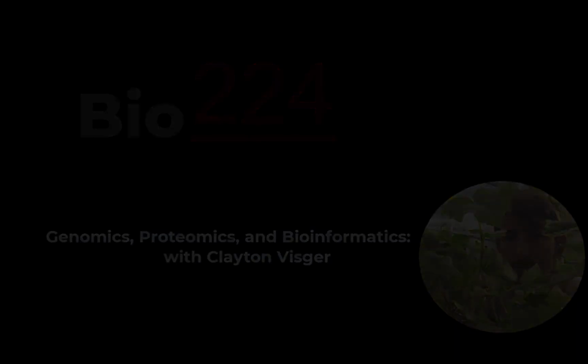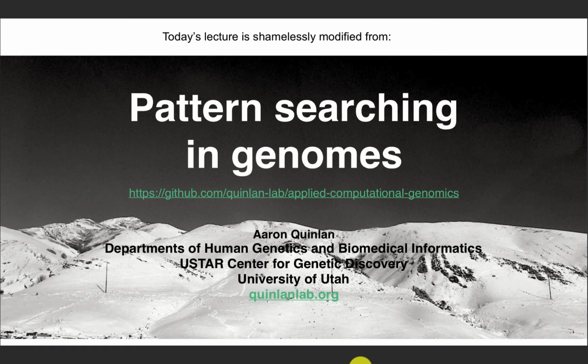Bioinformatics. Okay, welcome to Lecture 7. This is going to be pattern searching within genomes using the shell.